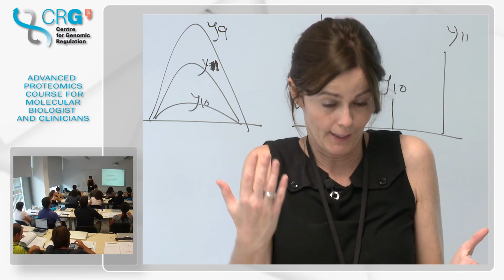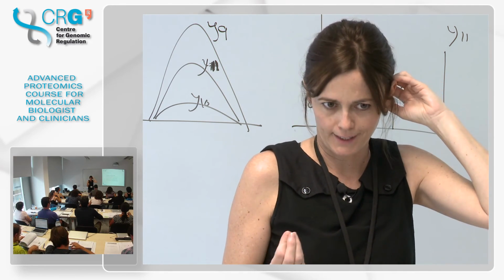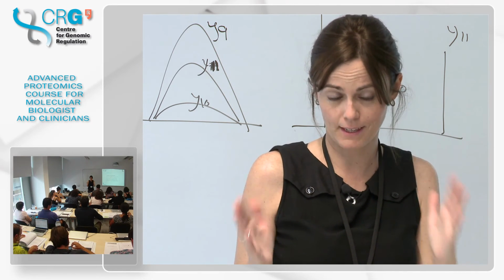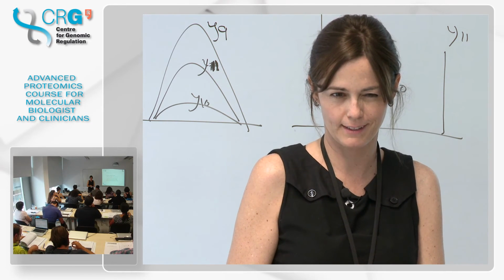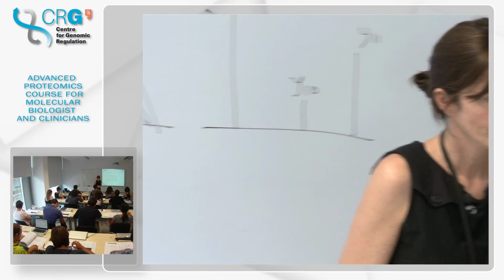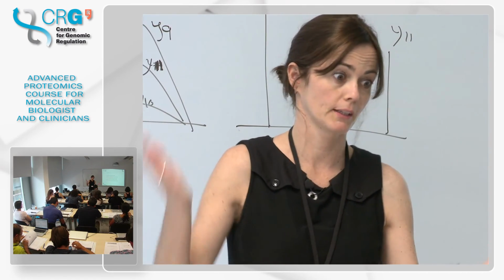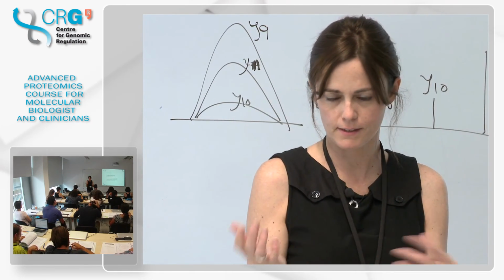If you would want to run more samples in 3 years, depending on the stability of your heavy peptide, this calibration curve can change because maybe you lost sensitivity. Yes, you lost peptide. Exactly, and then it's advisable to... If you lose the heavy peptide, it's degrading, then you overestimate the concentration. Exactly. So then it's advisable to run it again because you ran it a long time ago and maybe the sample was thawed and frozen so many times.